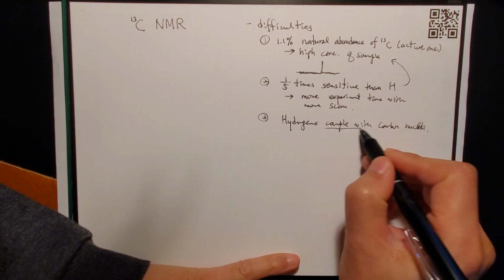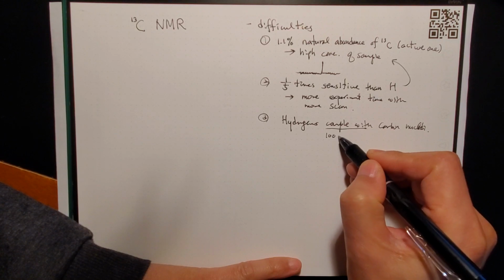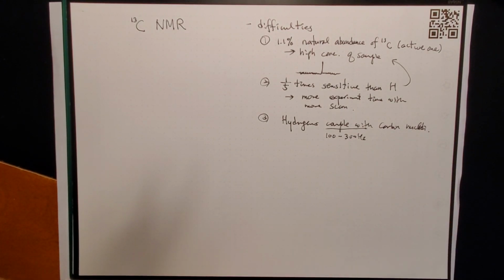The couplings are roughly 100 to 300 hertz, and that's a relatively big number for the splitting.